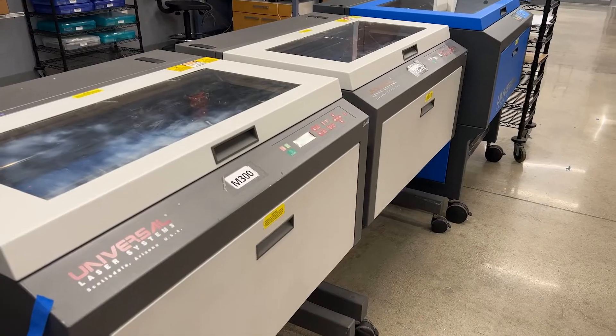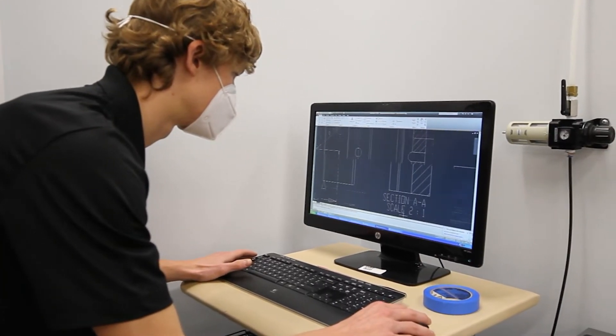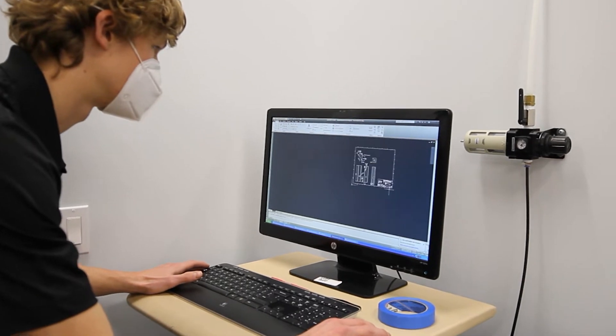At A-Line, we manufacture microfluidic devices using our proprietary laminate technology. This is a technology that's highly adaptable, so we're able to apply it to virtually any customer's design.